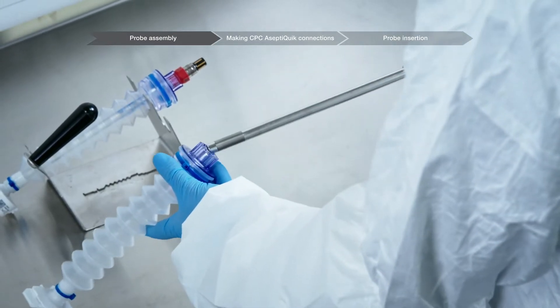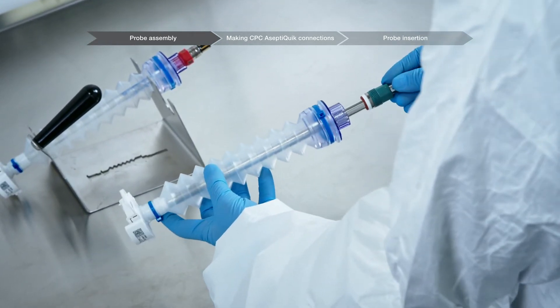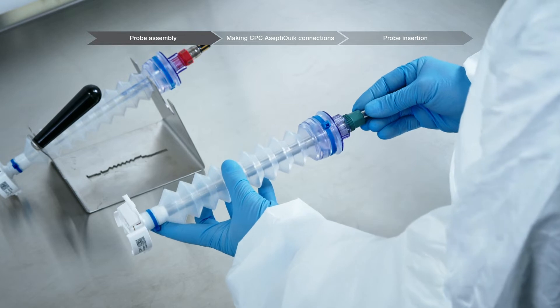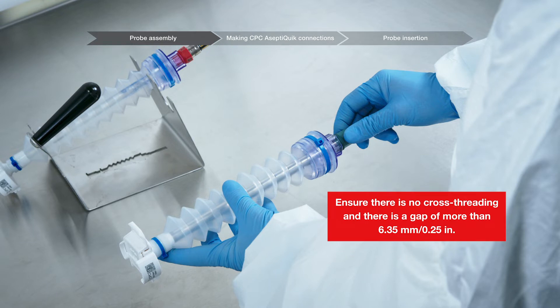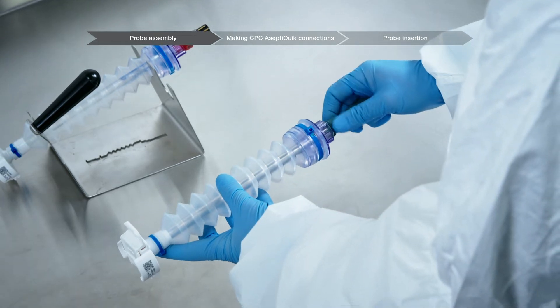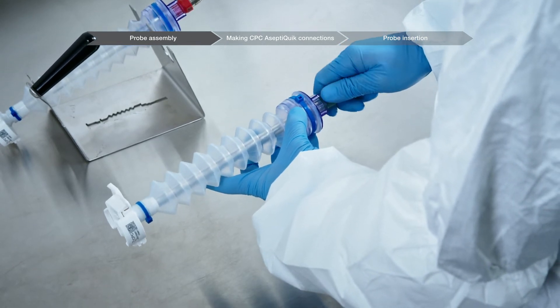Insert the probe into the probe assembly through the threaded adapter. Verify that the probe tip is not touching the membrane of the aseptic connector before threading into the probe adapter. Ensure that the thread of the probe is not cross-threaded in the adapter and that there is a gap of more than 6.35 millimeters or 0.25 inches. Hand tighten the adapter and verify that the probe tip is not touching the membrane.